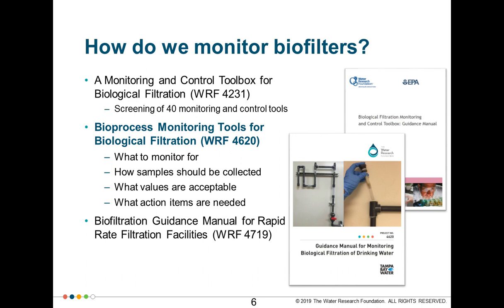So how do we monitor biological filters? Well, as Kanan mentioned, the Water Research Foundation has provided a substantial amount of funding to help propel our understanding and knowledge and research in this area over the past 10 years. There was an earlier project that CDM Smith and American Water collaborated on called a Monitoring and Control Toolbox for Biological Filtration. From that project, we evaluated 40 different monitoring and control tools and provided guidance on those tools that are most highly recommended for use for biofiltration monitoring.